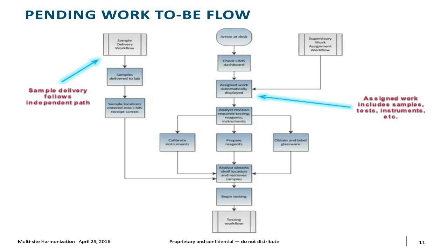Remember, in the as-is workflow, we were dragging pieces of paper to look at this, or we're pulling them out of Excel spreadsheets or something like that. So in this case, we're looking at samples, the tests, the instruments that are going to be used. If you're really good and have really thought about your LIMS implementation, you can do workload balancing on those instruments. We look at any opportunity for doing tasks in parallel.